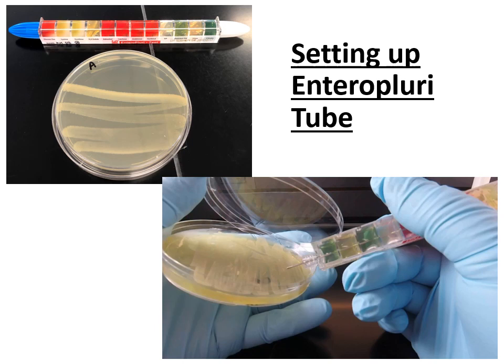And that will place some of the bacteria in each of the 12 agar compartments within that tube. And then you'll look to see what changes occur after incubating it.